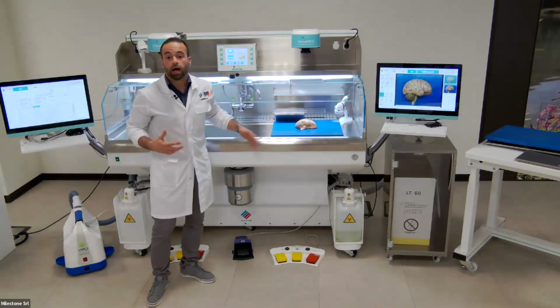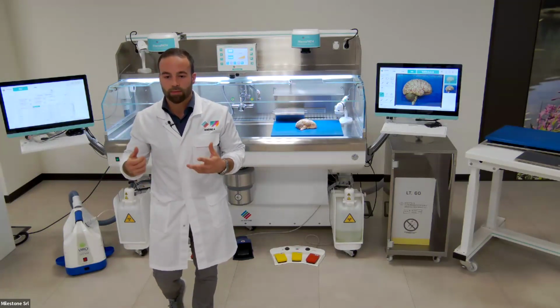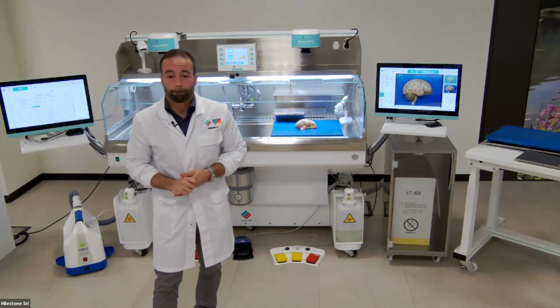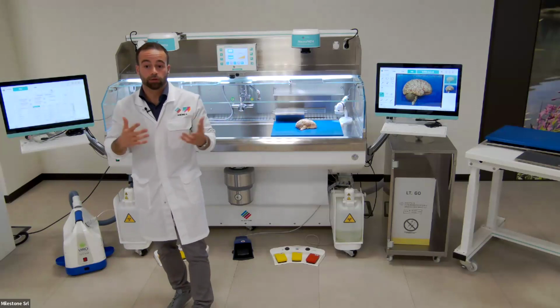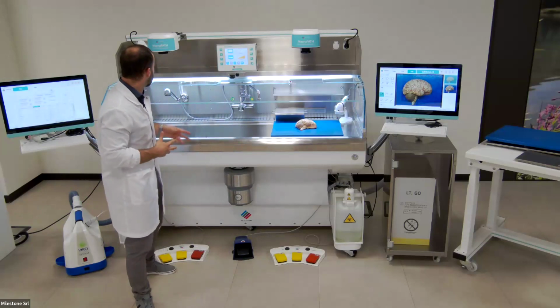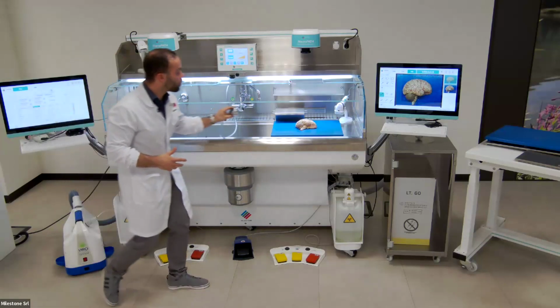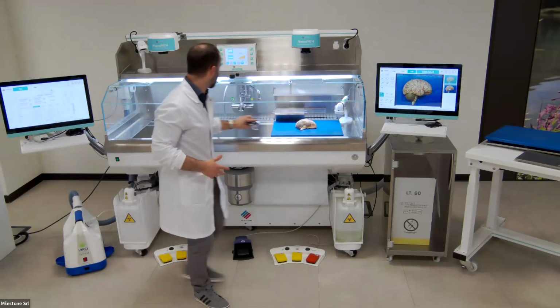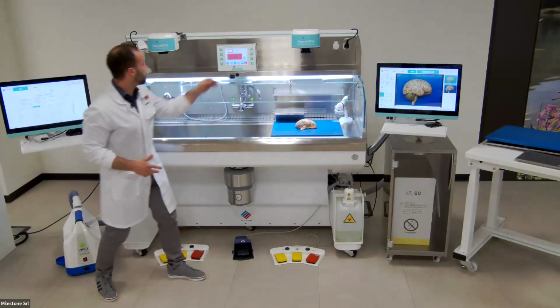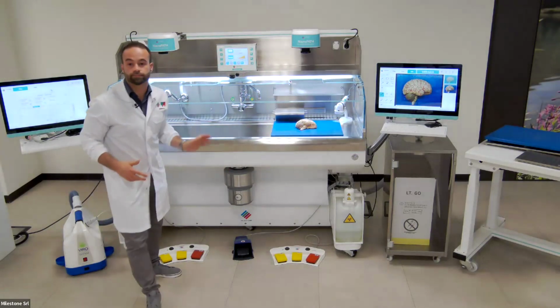For cleaning, for example, dirty colon, that is probably the biggest and dirtiest specimen that can arrive in a pathology lab, there is a shower. With this shower we can reach all parts of the working area. So the dimensions are really big.